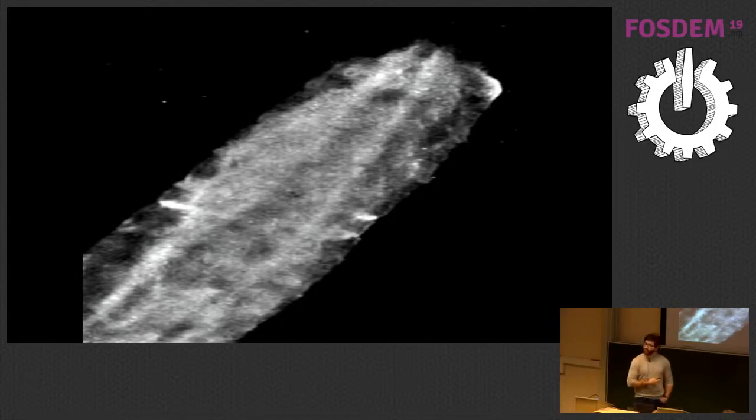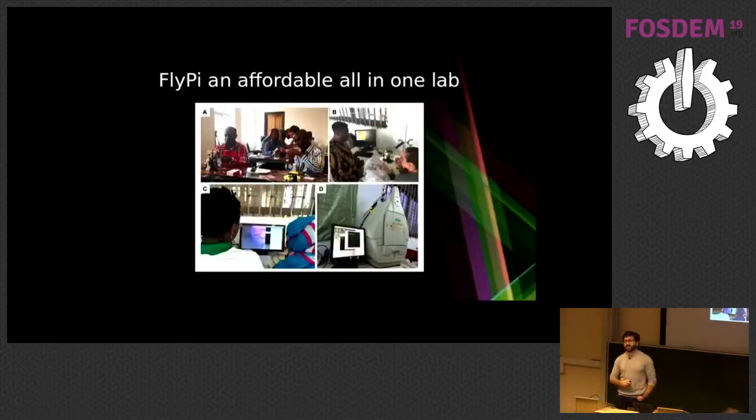Of course, these are all proof of principle experiments of what you can do with it, and we're hoping because this is open source, more people are going to pick it up, bring it to their own fields of study and help improve it. One thing that we've learned from teaching ourselves electronics is that any biologist can learn it. Because we are part of this NGO that is trying to help development in Africa, we started doing courses where we teach researchers inside academic institutions in Africa how to put electronics together to build their own equipment, right?